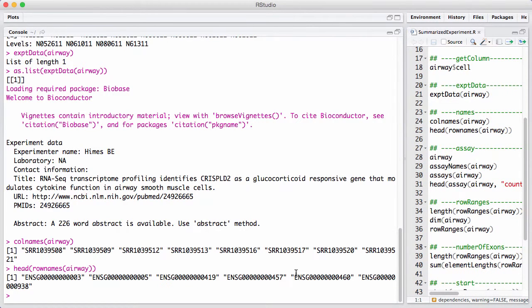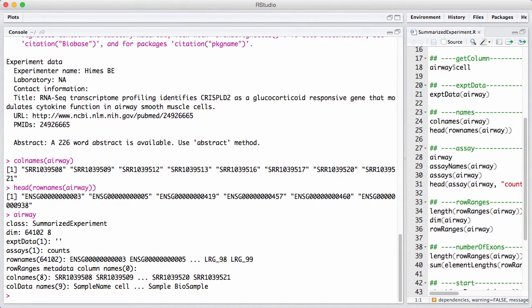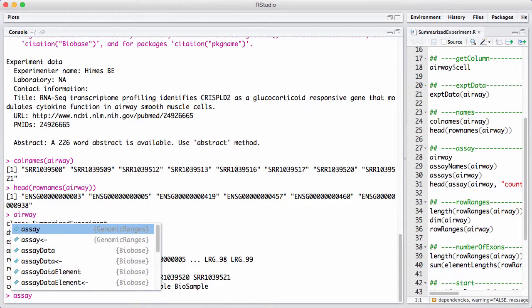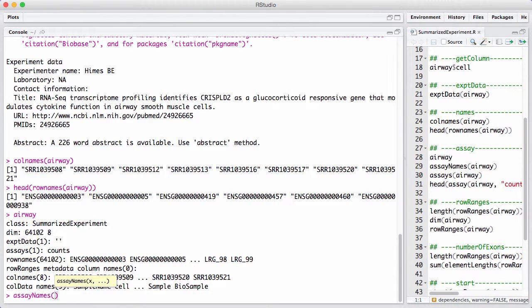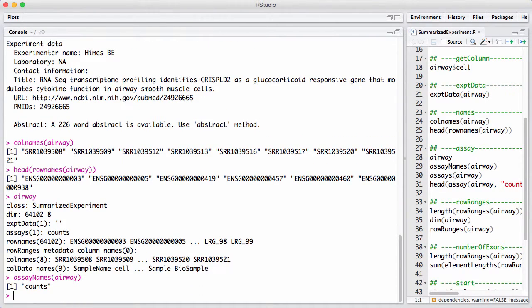How do we actually get the expression data? In this case it's not obvious, but this is RNA-seq data. In SummarizedExperiment, we use the assay accessor. To use it, we need to know what type of assay it is. Looking at the printout of the object, we can see there is one assay called counts. We can also get the list of all assays by writing assayNames, which gives us back just counts.